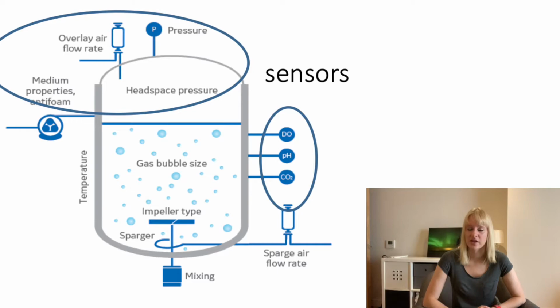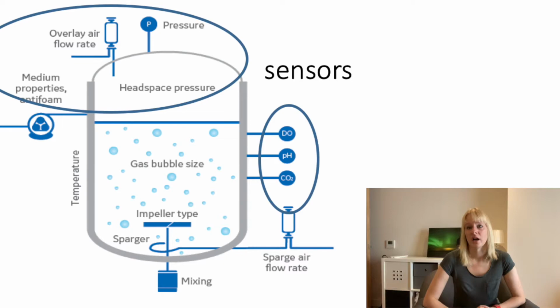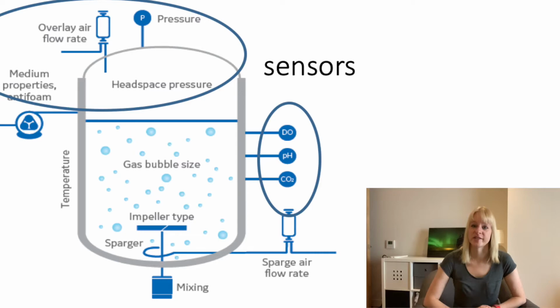So for the dissolved oxygen, obviously you need to make sure that it's sufficient for your organisms to survive. And the dissolved carbon dioxide, first of all, influences the pH, so that's another thing you might check. And it will also tell you whether your microorganisms are still replicating, because as we breathe out carbon dioxide, these microorganisms also produce carbon dioxide as they grow.